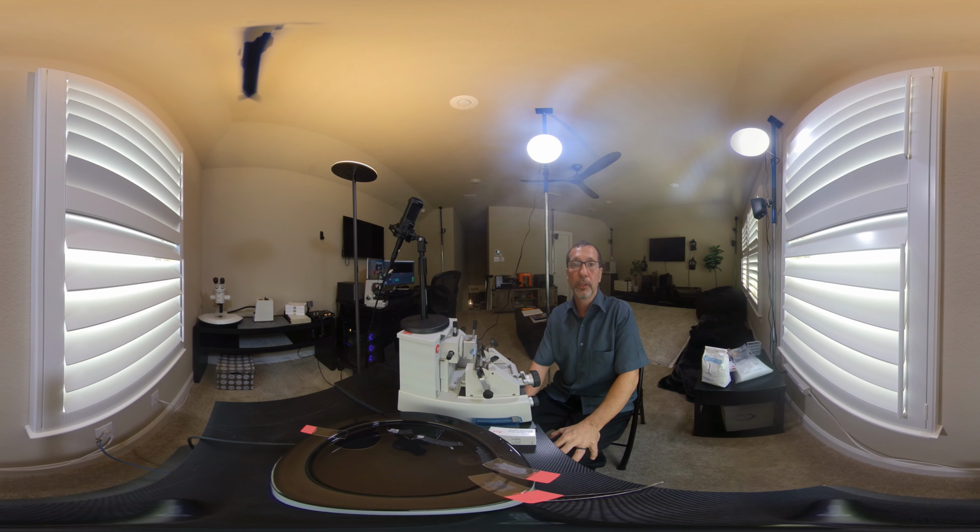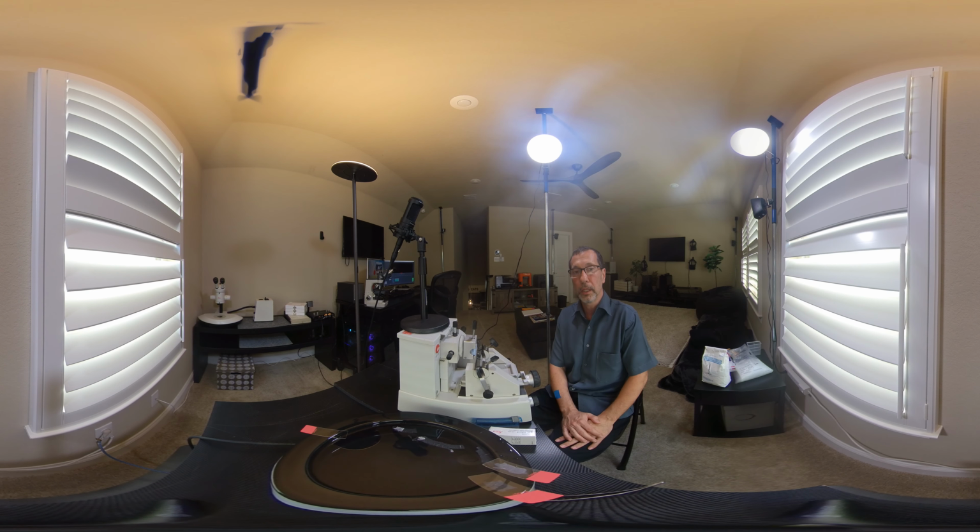Welcome to an introduction to clinical histology. In this lesson, we're going to talk in a little bit more detail about the use of paraffin, as it plays a major part in many of the work areas of the clinical histology lab. But first, let's think of a few variables to consider when we work with paraffin.